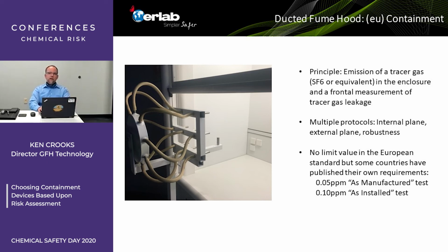There's no limit value in the European standard, which I find interesting, but here ASHRAE 110, also CSA 316.5, the as manufactured test. So the manufacturer has a test laboratory, the fume hood manufacturer. They install it under ideal, absolutely perfect conditions, of course. It's their product, brand new in their test lab. It doesn't get any better than this. There's no humans, there's no users, there's no loading of the fume hood yet.